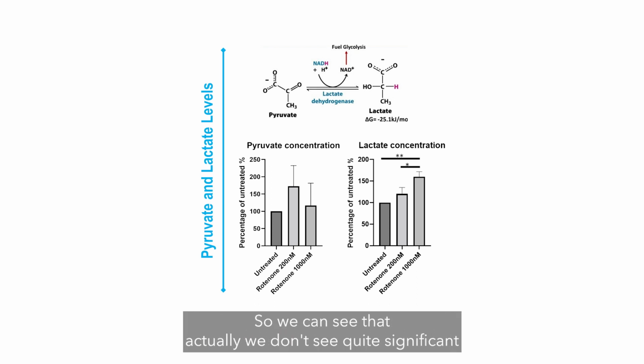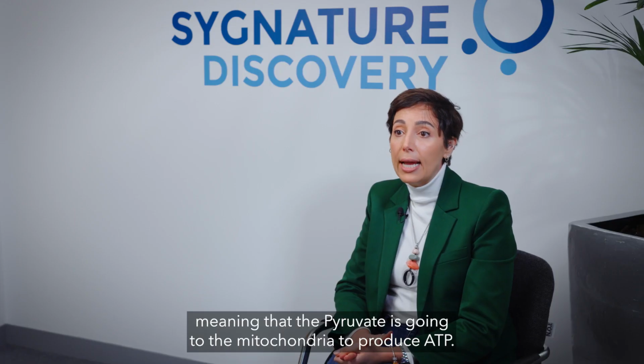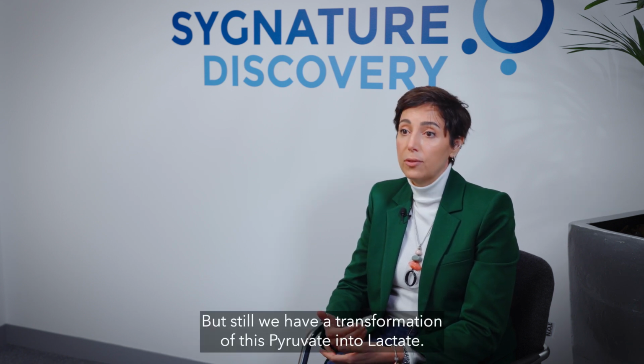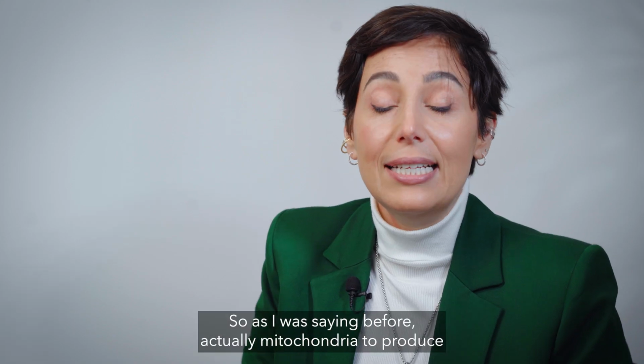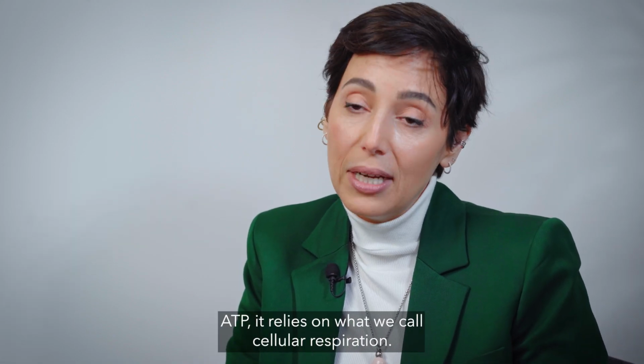we can see that we don't see quite significant changes despite this increase in pyruvate. However, we do see a significant increase in the lactate levels, meaning that the pyruvate is going to the mitochondria to produce ATP, but still we have a transformation of this pyruvate into lactate, and this can mean that the cells are struggling.